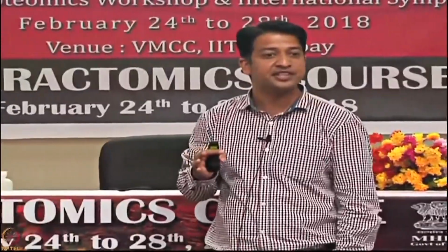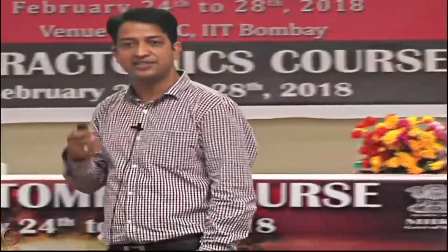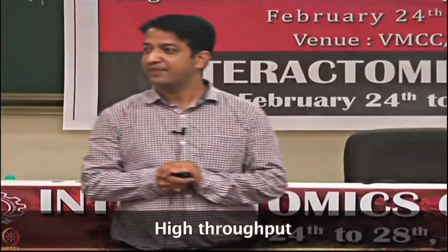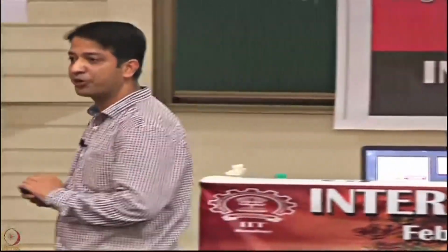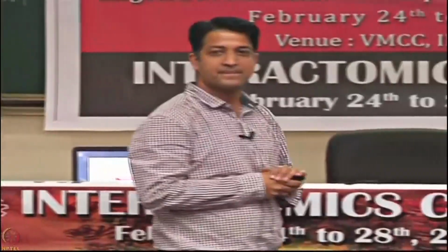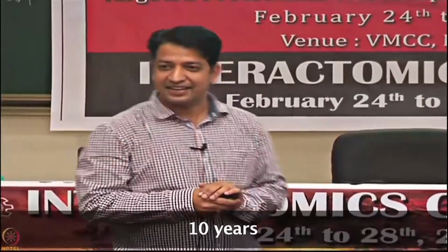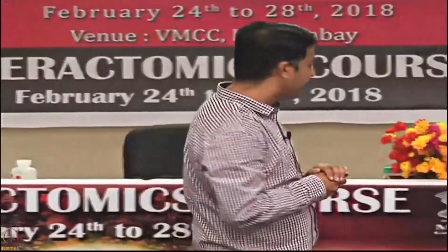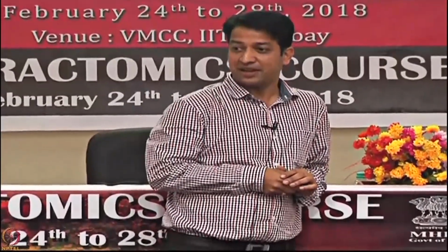and the ideal length of a gene in human is almost around a kb, correct. But why do we need NGS? Now, the point is, why is NGS required? Great. So, the right answer is throughput, right. Any idea about how long the first human genome took to get sequenced? It took 10 years, and almost $3 billion was invested for the first human genome to be sequenced.